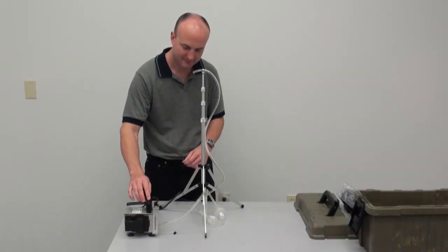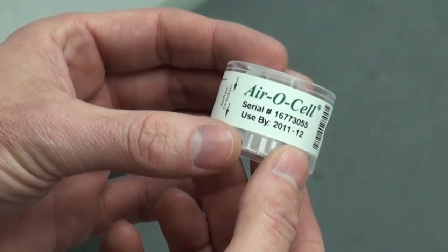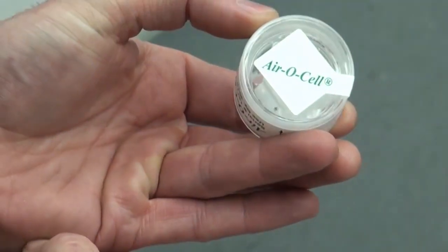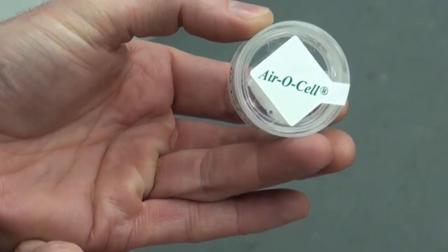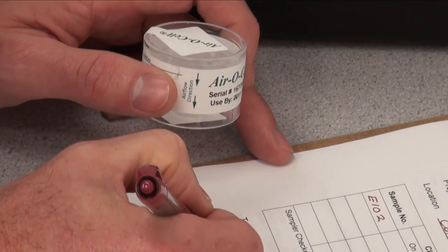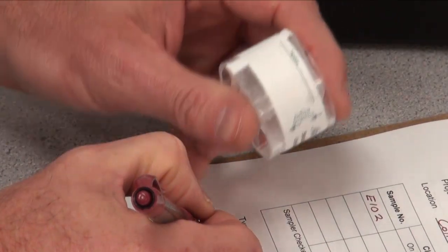Turn off the sampling pump. Verify the use-by date on the aerosol cassette and check that the security band around the cassette has not been broken. Record the cassette serial number on the lab chain of custody sheet along with any other required information.